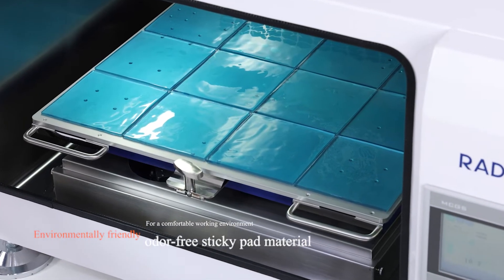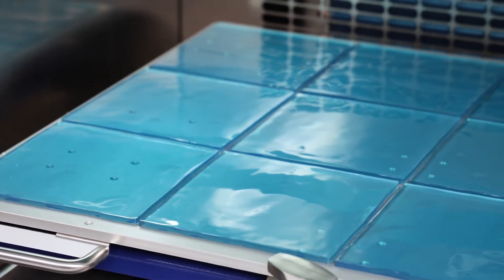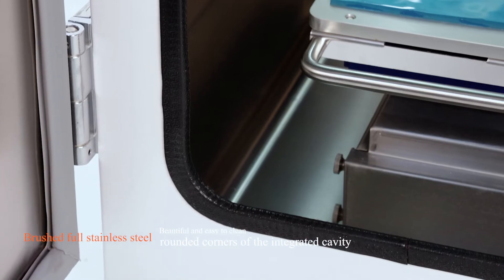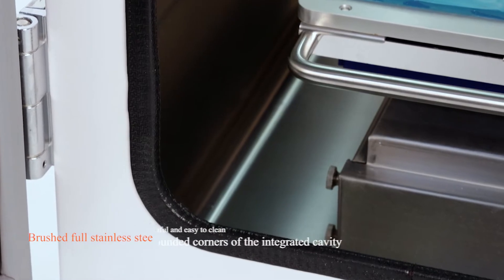Environmentally friendly, odor-free sticky pad material for a comfortable working environment. Double glass doors ensure excellent insulation and security. Brushed full stainless steel rounded corners of the integrated cavity, beautiful and easy to clean.